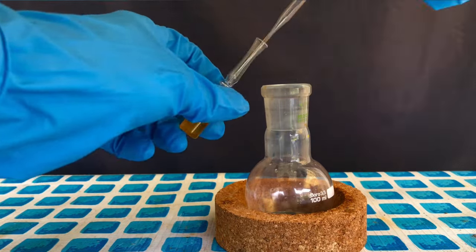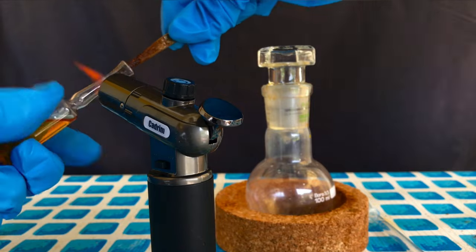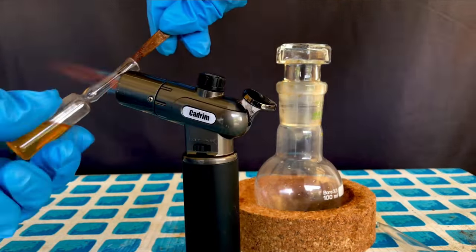I have used a PTFE-lined flask before for storing phosphorus pentachloride, and I'm never going to do this again. Some chlorine leaked and got behind the PTFE seal.